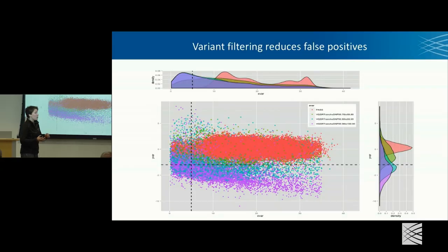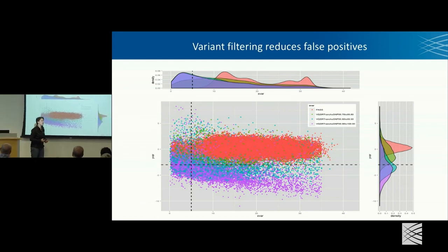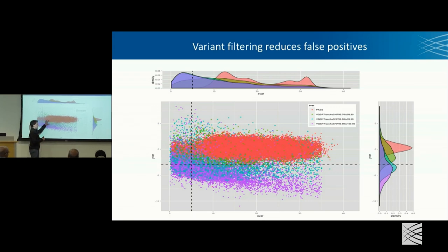Okay. Once we have the variant calls, we're going to apply some filtering techniques. This is an area where a lot has evolved recently. We're increasingly using machine learning approaches. The idea is to be able to distinguish programmatically, after the calling and based on some additional modeling, which variants are likely to be real versus artifacts. Because the variant caller is designed to be very sensitive, to call as much as possible, and then we have this filtering, as a post-processing step, to separate the wheat from the chaff, okay?